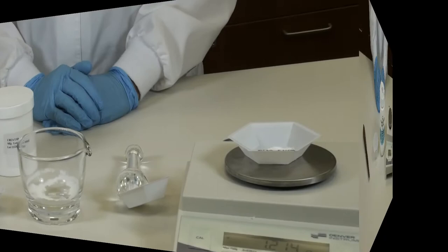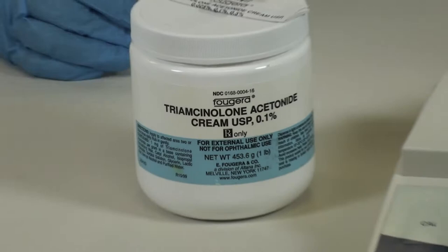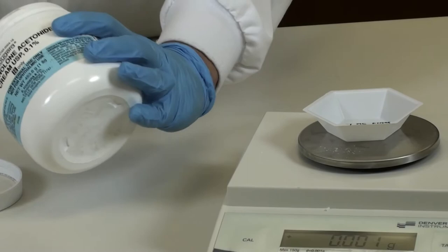To get our triamcinolone active ingredient, we're using a commercially available 0.1% cream. So go ahead and put a weigh boat on your scale, tare it, and weigh the required amount of 0.1% cream required for the prescription.